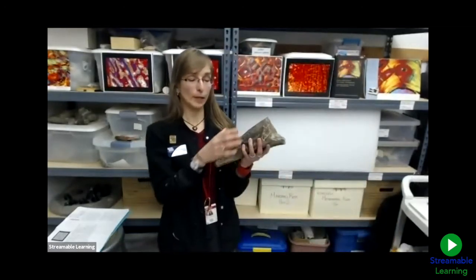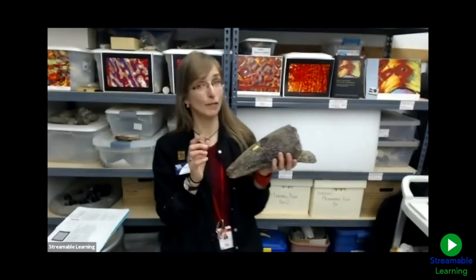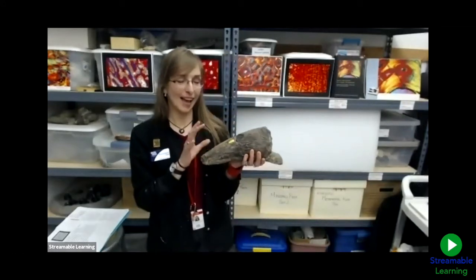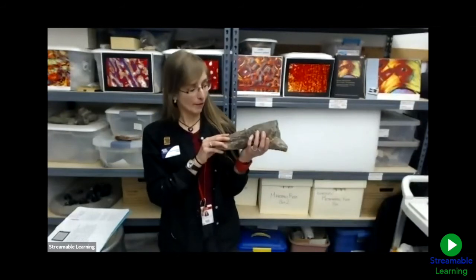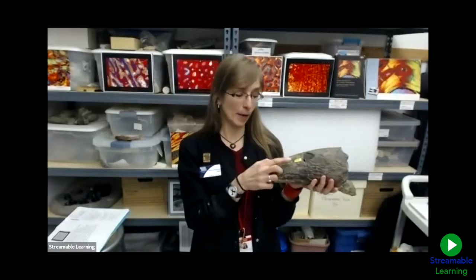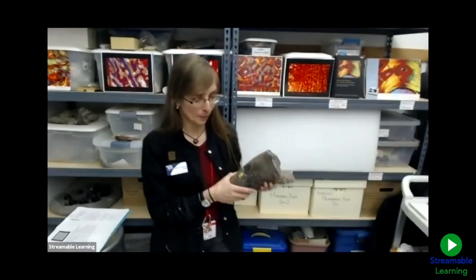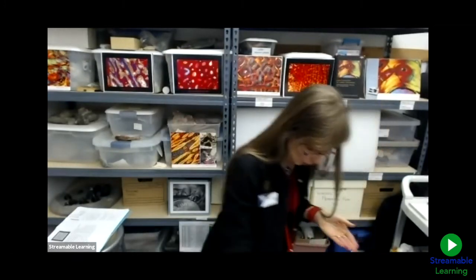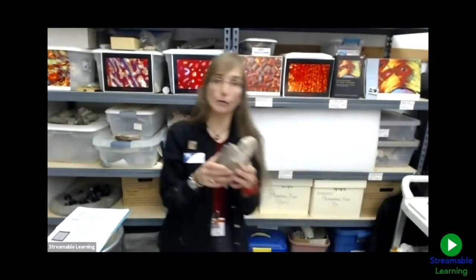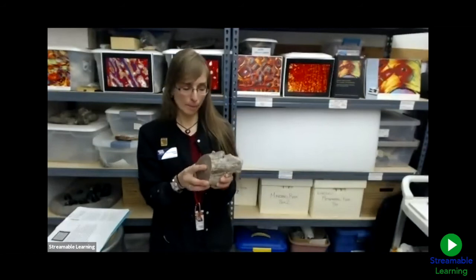Then, while the fossil is still intact, we'll make a replica. In some cases, we will replicate the entire fossil, as in this case with this Triceratops horn, which looks very real, thanks to the excellent painting job done by some of my volunteers in the Paleohistology lab. We can tell this is a cast by the yellow. That's our code for when we return a cast to collections. In other cases, we will make a cast replica of just the part of the fossil that we're interested in making thin sections from.